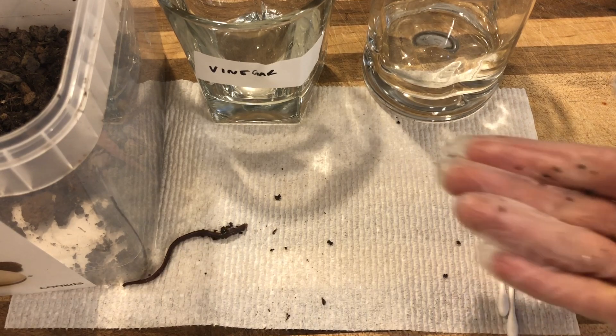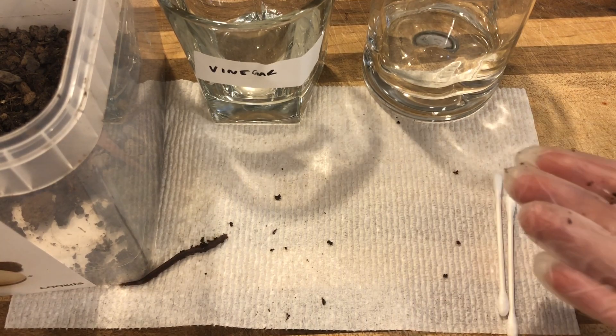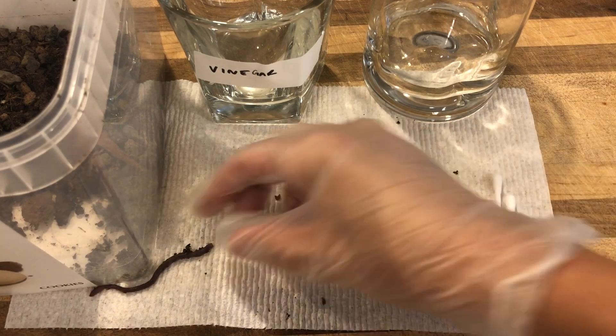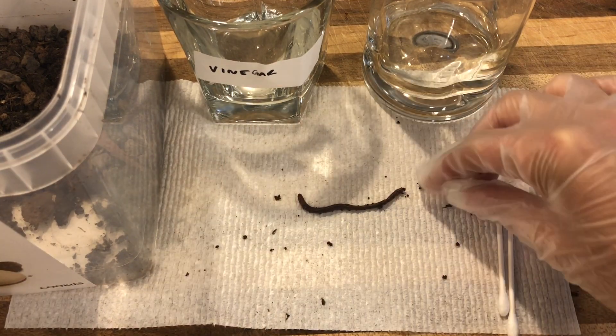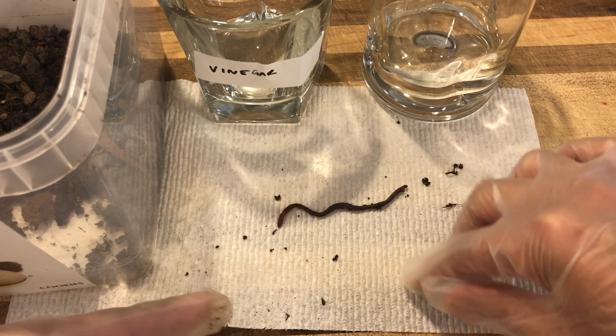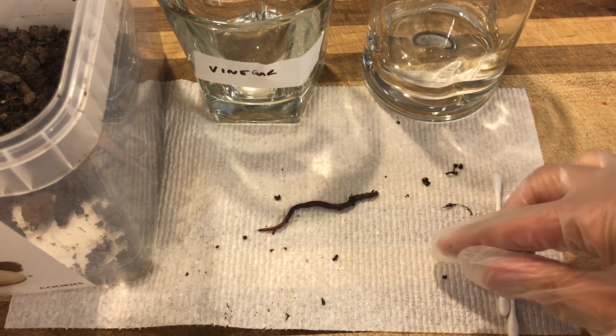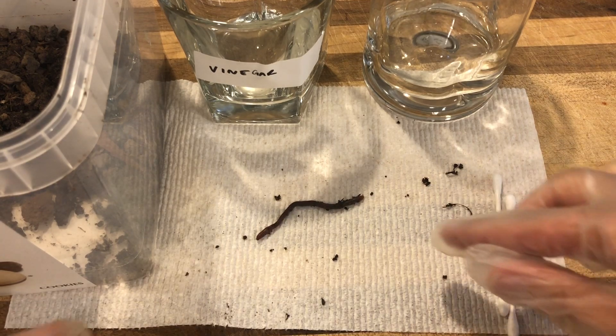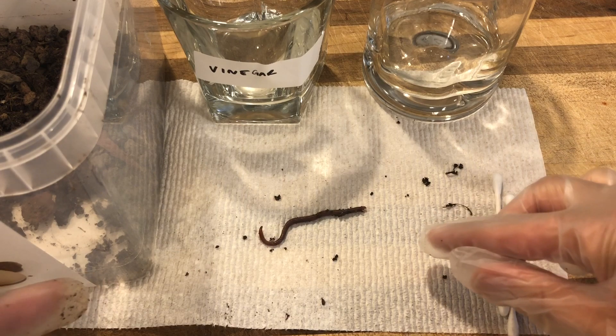Before this little guy gets out of here, I want you to make three observations about the worm. Remember, an observation is something about its physical characteristic — something that you can observe with your five senses — and it's not an inference. So it's not something that you are guessing about the worm or predicting about the worm. Go ahead and using this video or your own worm, make three observations on your own.